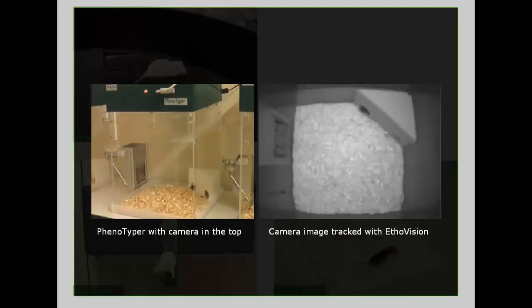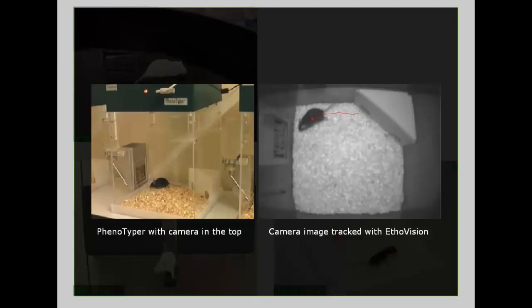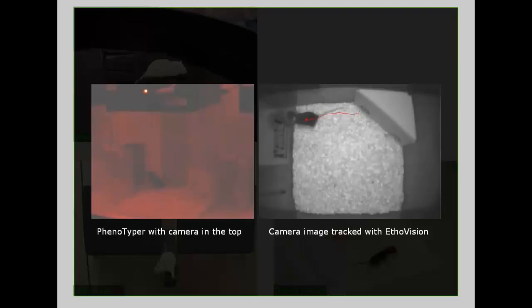In this video you see that EthoVision keeps tracking the animal even though the room light is switched off, leaving only infrared lighting in the cage.